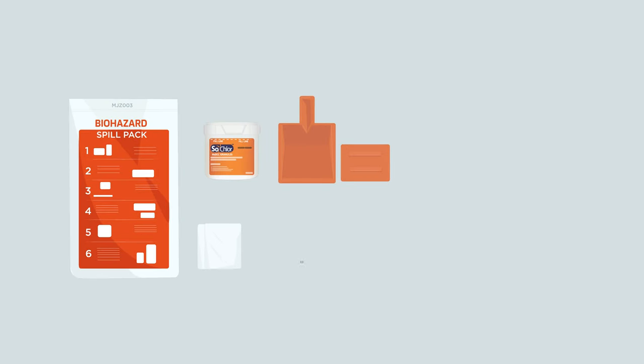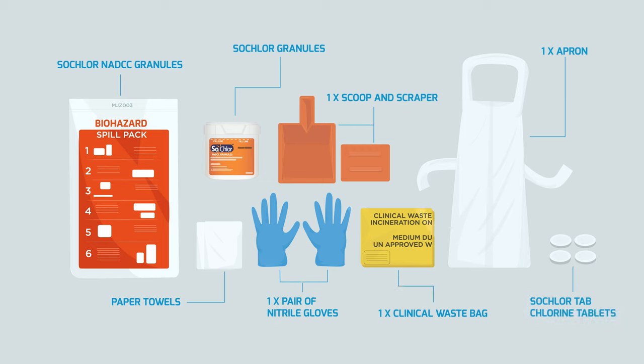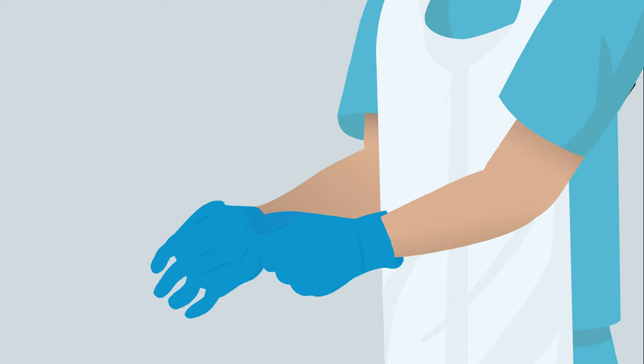GV Health spill packs and kits provide an accessible, easy-to-follow and safe solution to ensure best practice and compliance for spill clean-up procedures, providing all certified PPE and recommended active ingredients in one place.